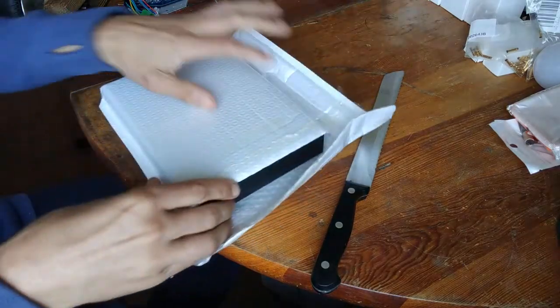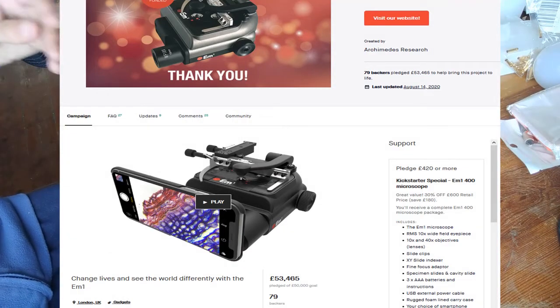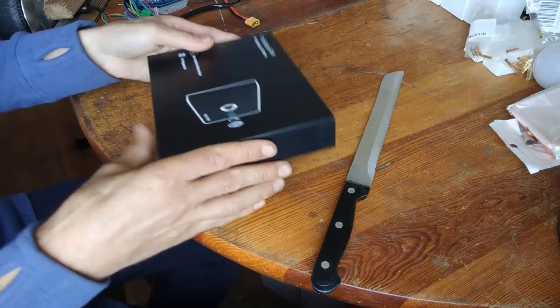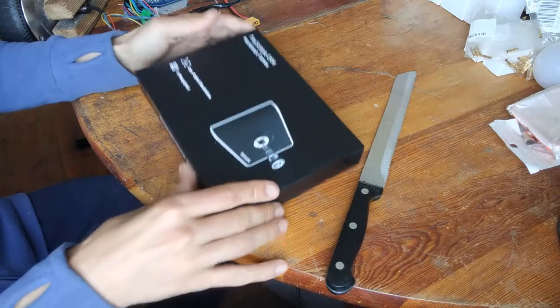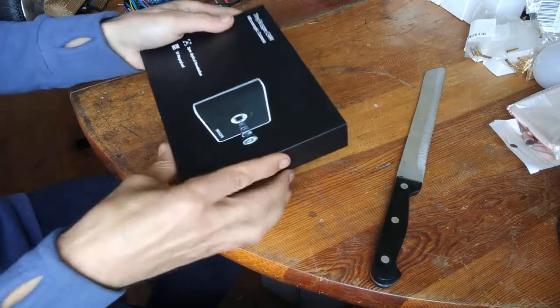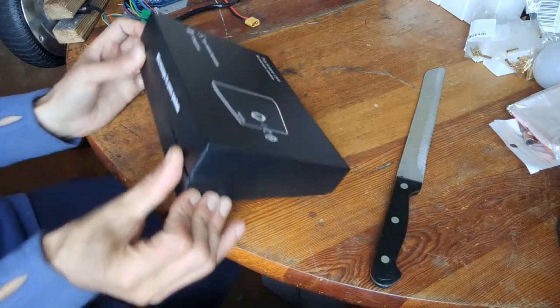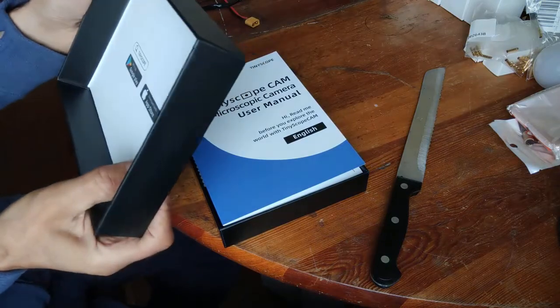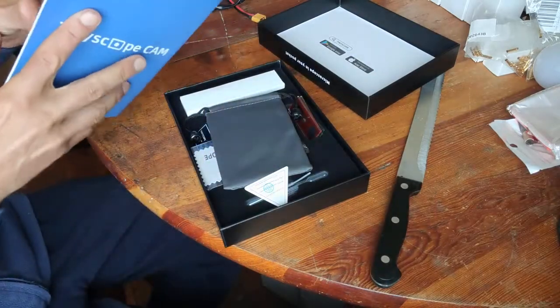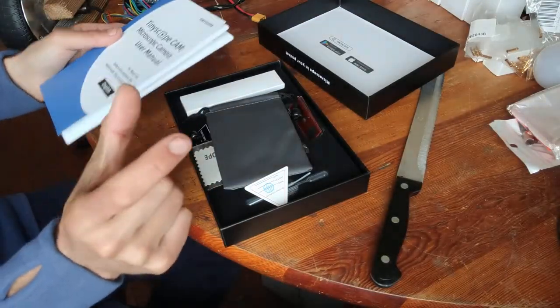There are other Kickstarters that offer real scientific pocket microscopes. But they specified something — I think it was Japanese — about the smartphone camera being a Sony sensor. The creator was very open and responsive. I consider this a success.